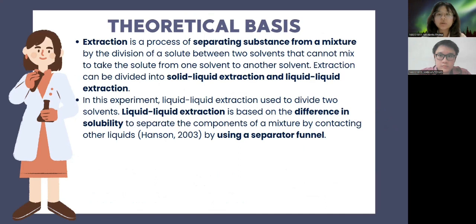Extraction is a process of separating a substance from a mixture by the division of a solute between two solvents that cannot mix, to take the solute from one solvent to another solvent. Extraction can be divided into solid-liquid extraction and liquid-liquid extraction. In this experiment, liquid-liquid extraction is used to divide two solvents. Liquid-liquid extraction is based on the difference in solubility to separate the components of a mixture by contacting other liquids using a separator funnel.